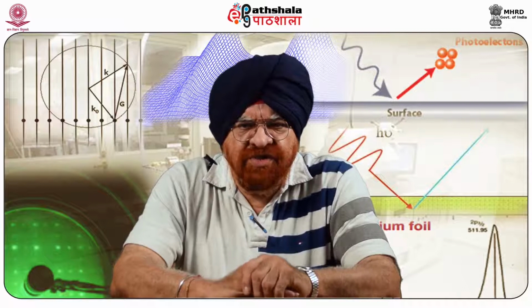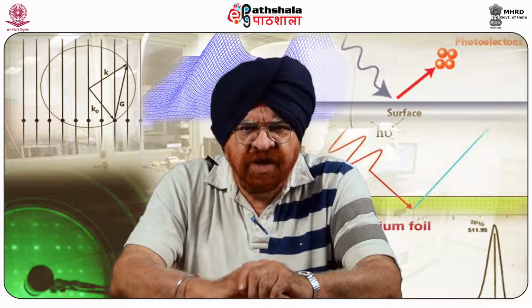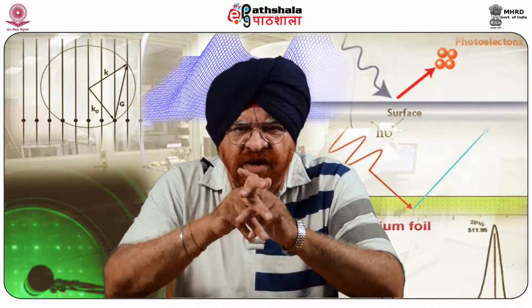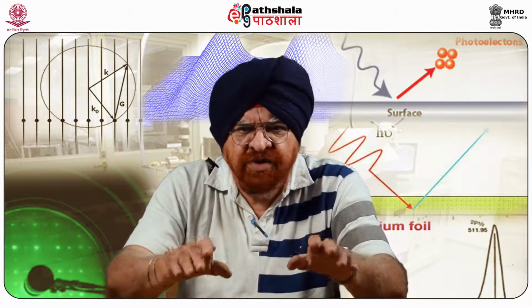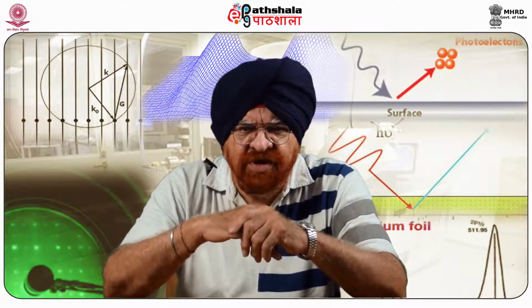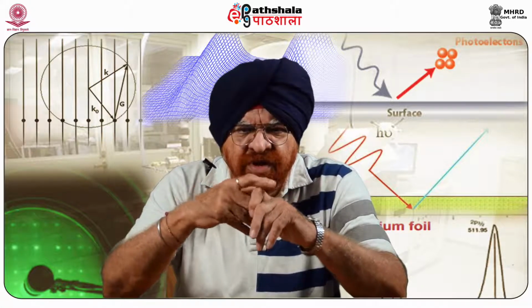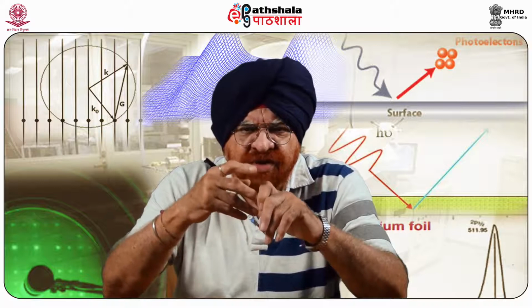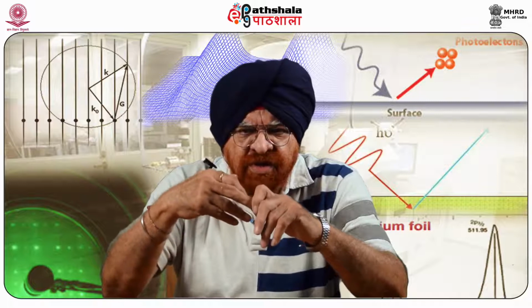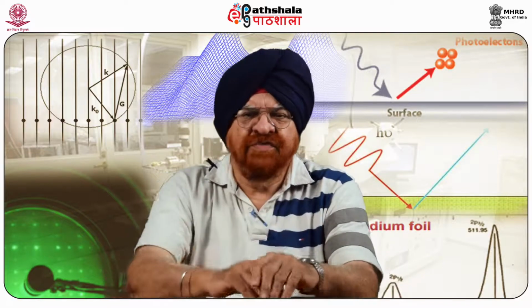The cantilever in the AFM is a reference electrode that forms a capacitor with the surface, over which it is scanned at a constant separation. This is what you don't find in some of the other spectroscopies. The cantilever is not piezoelectrically driven at its mechanical resonance frequency, as in normal AFM, but an AC voltage is applied at this particular frequency.